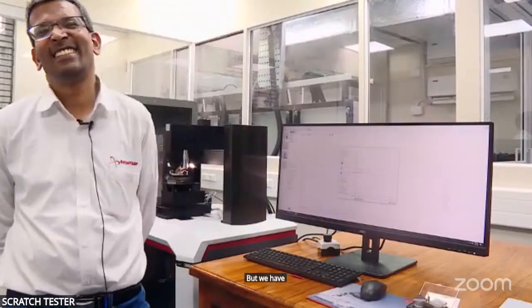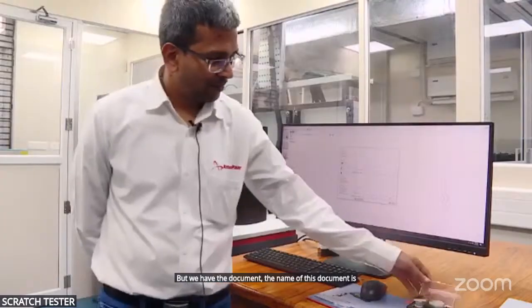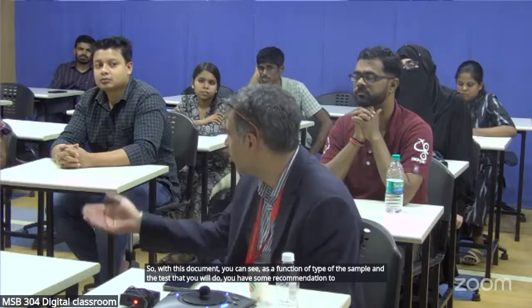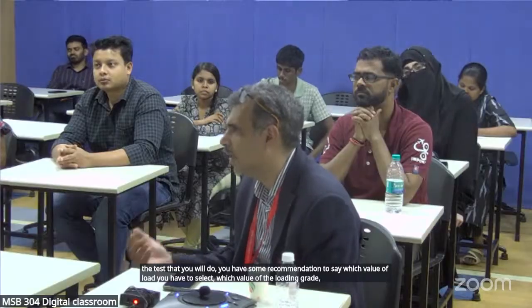But we have a document. The name of this document is recommended parameters and troubleshooting. With this document, as a function of the type of sample and the test that you will do, you have recommendations on which value of load and which value of loading rate to select. So this will help you to select the good parameters.